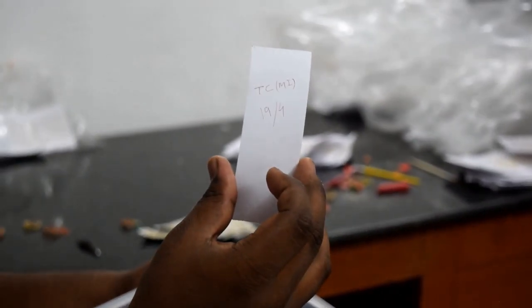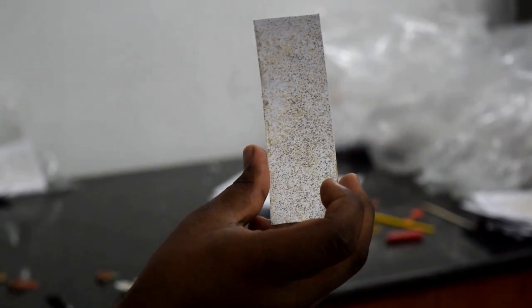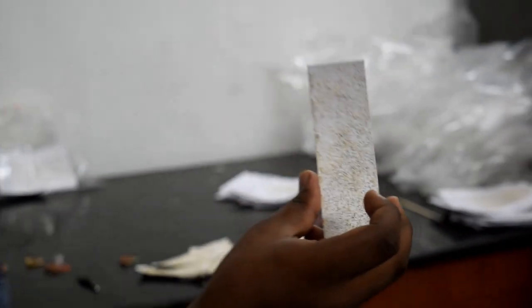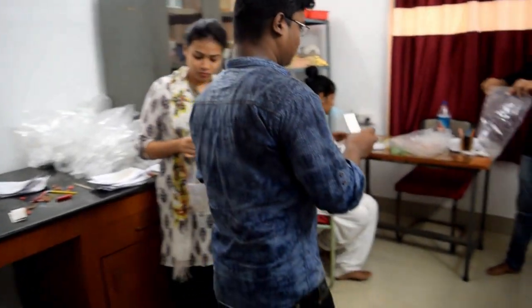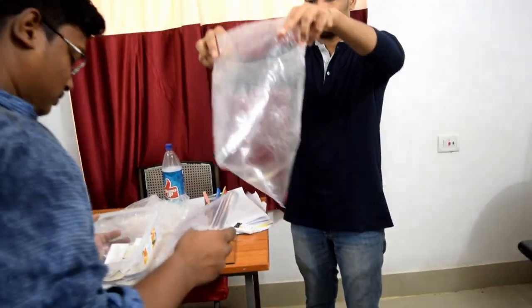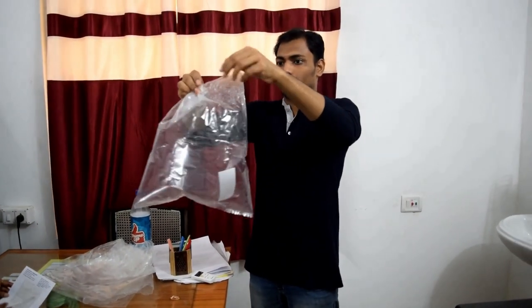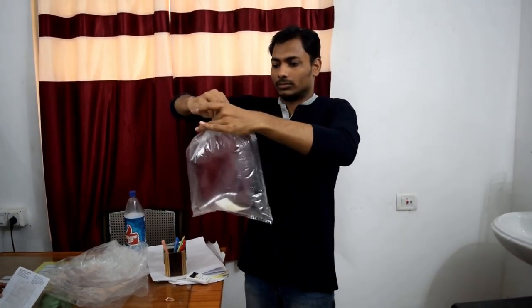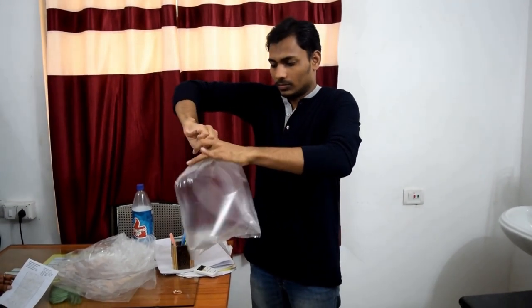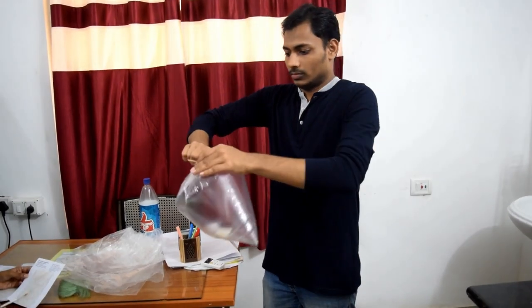The inoculum cards are taken out of the refrigerator and are placed singly in polythene bags along with air. The mouth of the bag is tied with rubber band. These bags are arranged on a laboratory table for adult emergence.